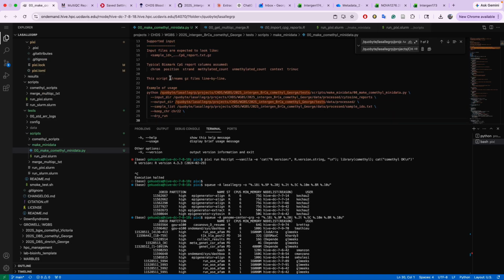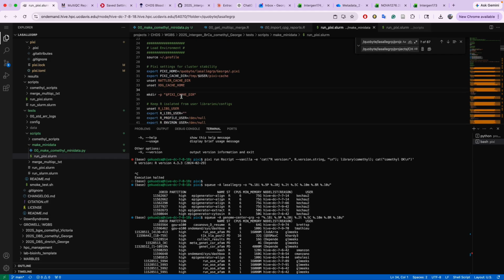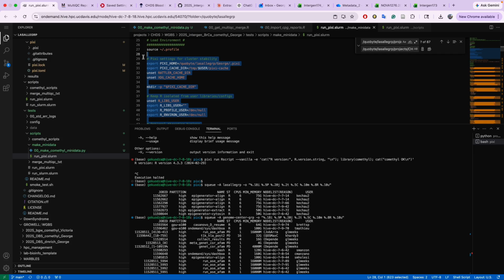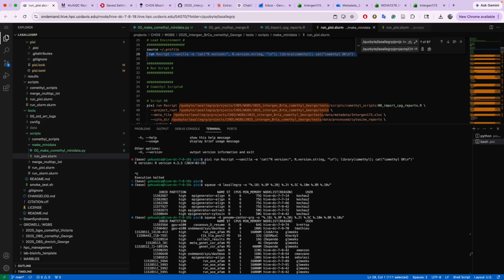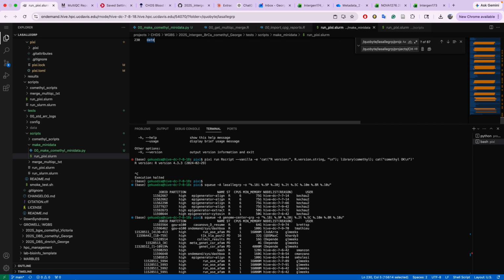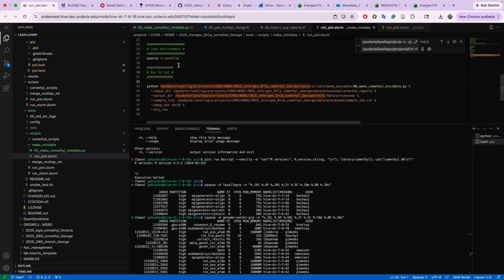All right. So basically, we're gonna add this script. I'm gonna delete all this other stuff because this is all specific to my Pixie run, and it will waste our time. And we don't need Comethyl now. So that's just gonna be it, and then it's not gonna be a dry run. It's gonna be an after run.